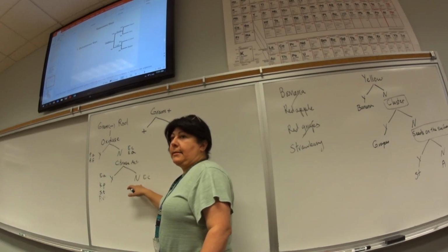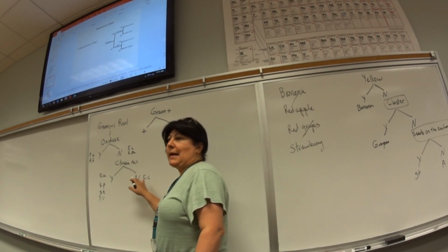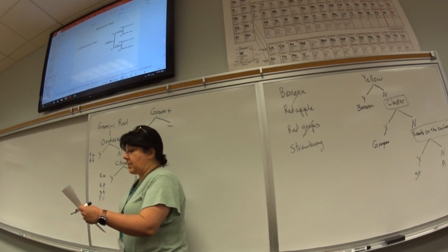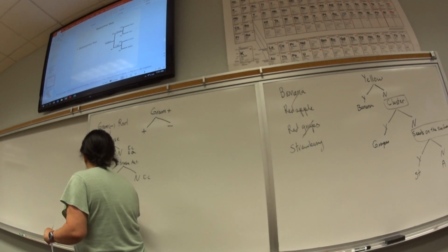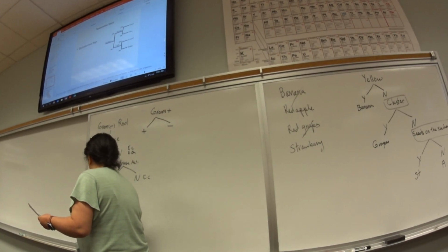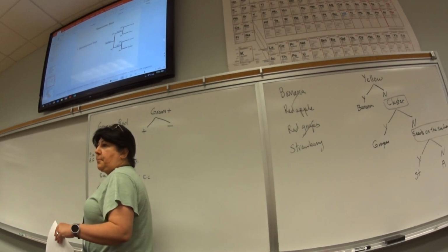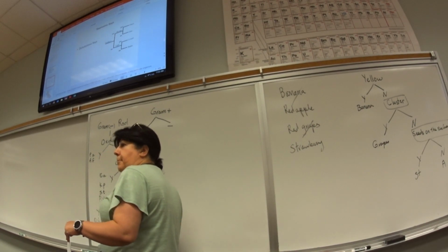You can actually add more tests here next to it. Say, in addition, EMB was metallic green or whatever. If you're not here, between these 3, let's say indole production. So indole. Yes, no. The only one that is positive for indole production is P. vulgaris. The others are negative. If it's positive, you're done with P. vulgaris. If it's negative, you kind of have to separate those 3.